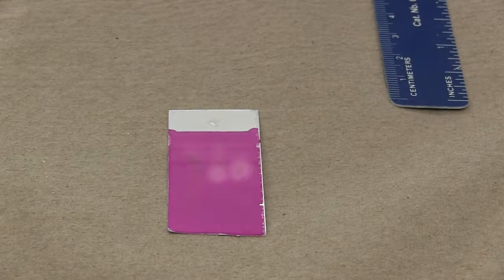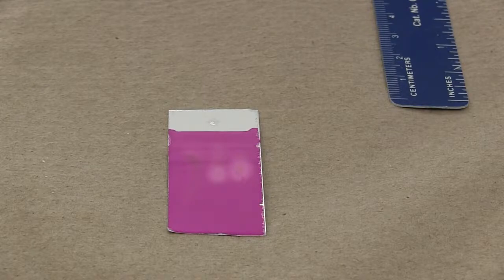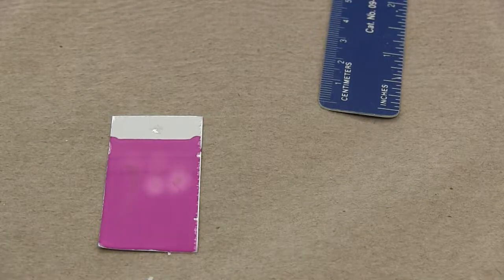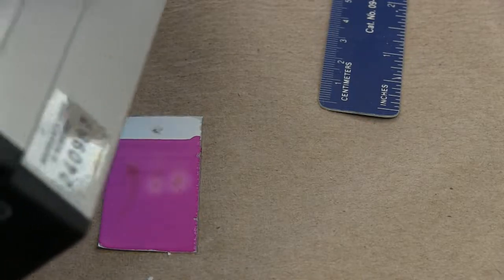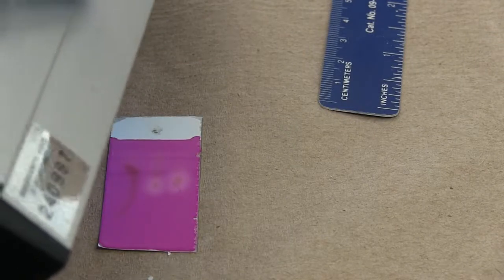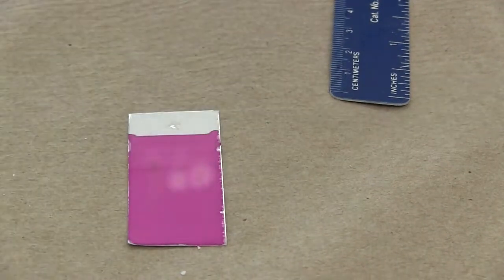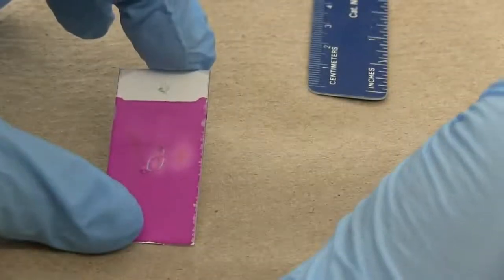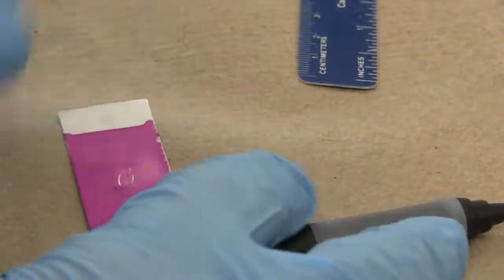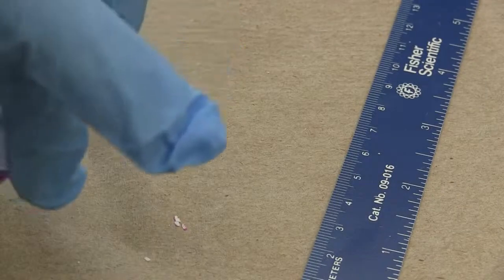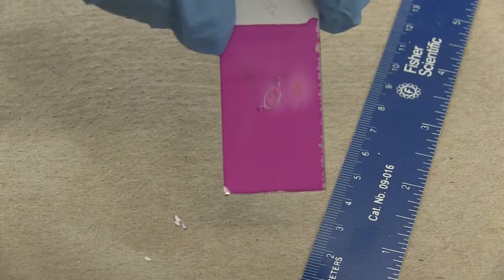All right, so we developed a TLC plate in 2 to 1 hexane ethyl acetate. If you need a reminder on how to do a TLC, you can look at our TLC video for the 361 lab but we spotted from left to right our benzoin, our crude product and our recrystallized product. We then looked at it with UV and there was a couple spots we could see. Under UV, we were able to see, now that we've treated it, it's showing up a little bit there. The benzoin did smear a little bit and curve up when we put it in the plate but it didn't do too bad. And then we have our two spots here. We'll go ahead and mark those down. All right, so it's actually just getting rid of the silicon dioxide so we won't mark those down. But we will record the RF values for those and then compare them to the benzoin. So we definitely got a different product. There may be a little bit of benzoin in our product still but here it's at a different level.